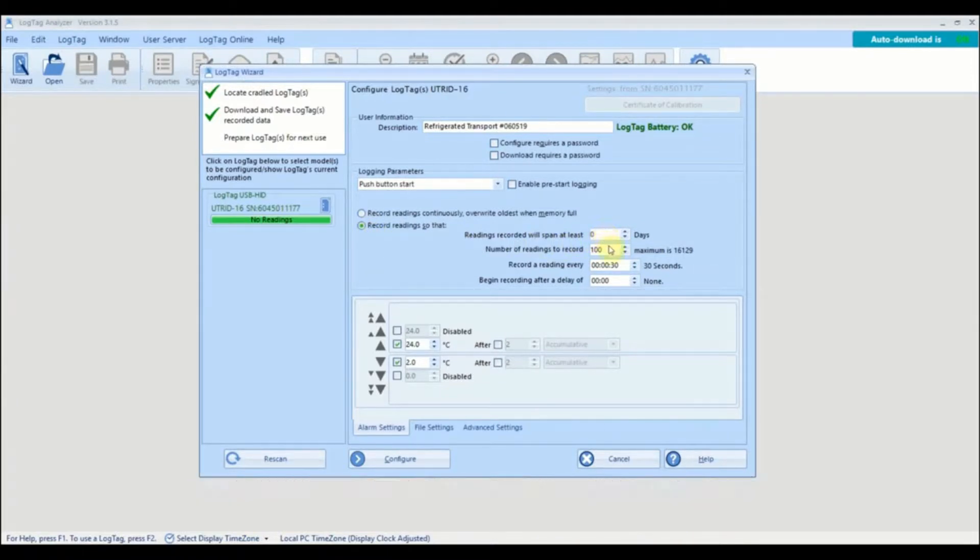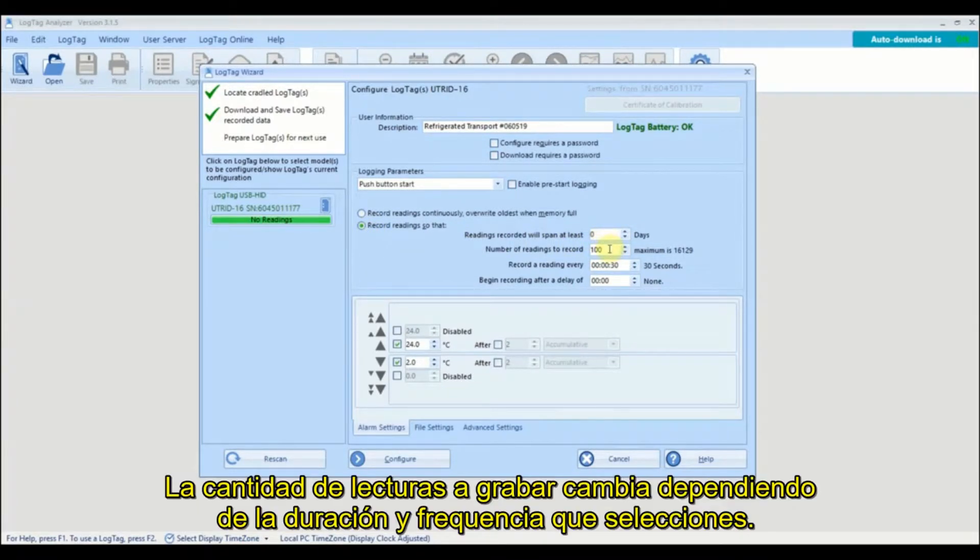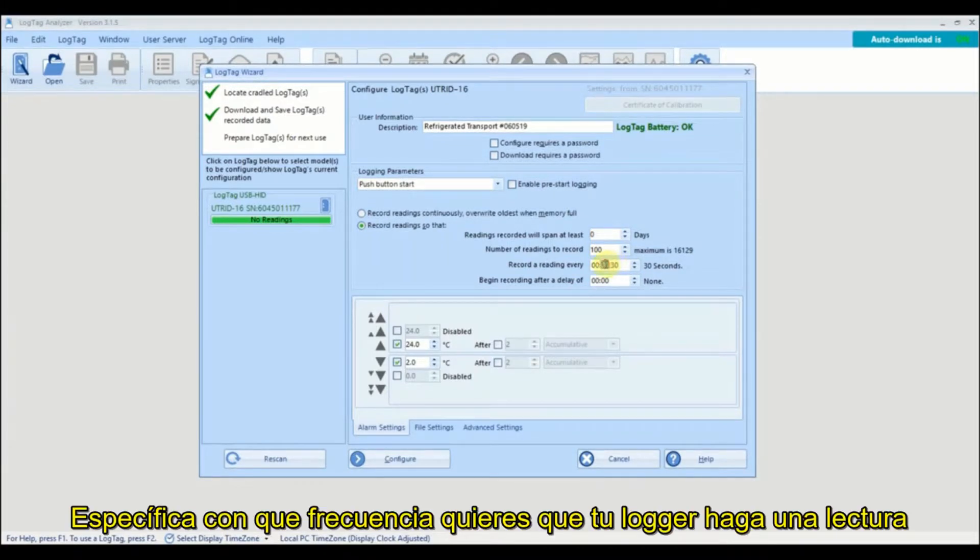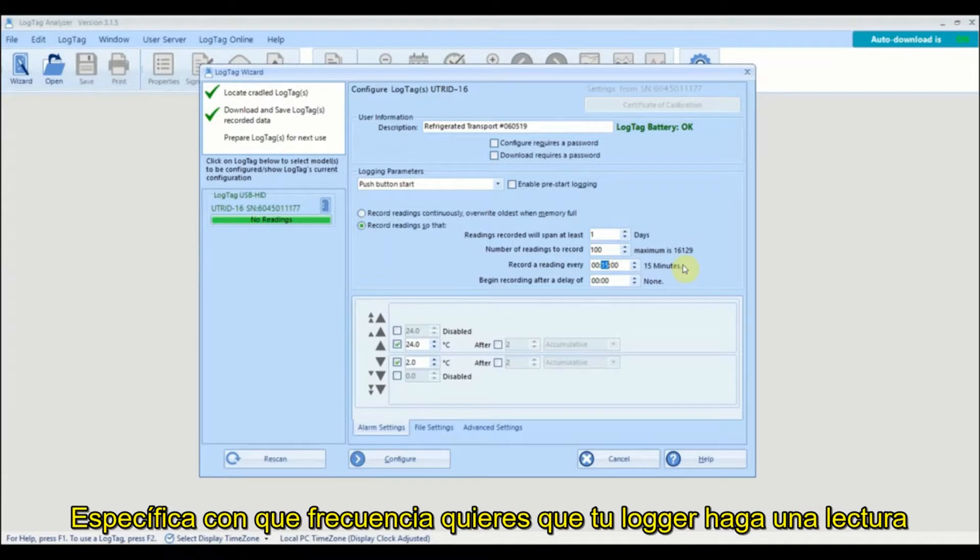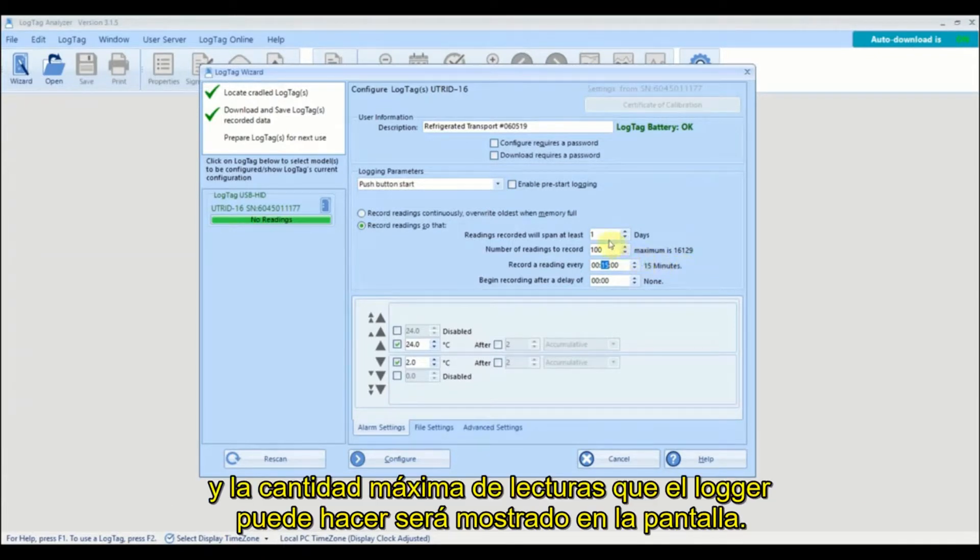The number of readings to record is changed according to the duration and frequency of your readings. Specify how often you want your logger to take a reading and the maximum number of readings the logger can take will be displayed.